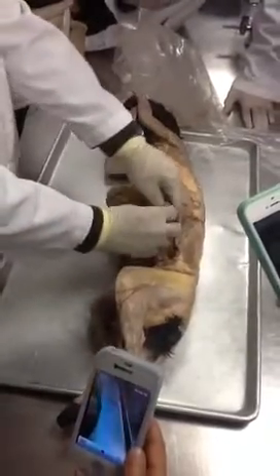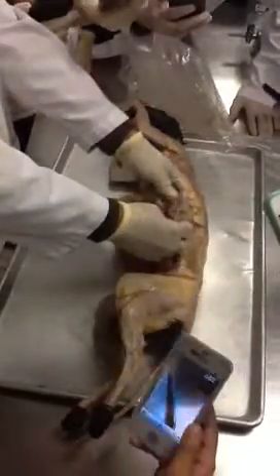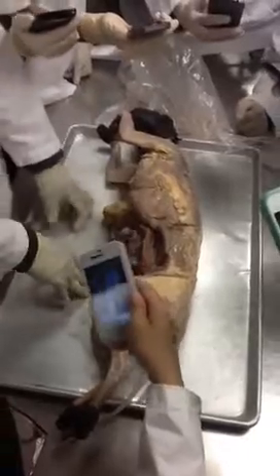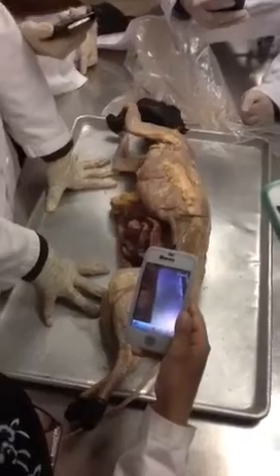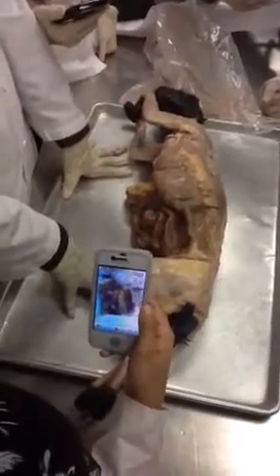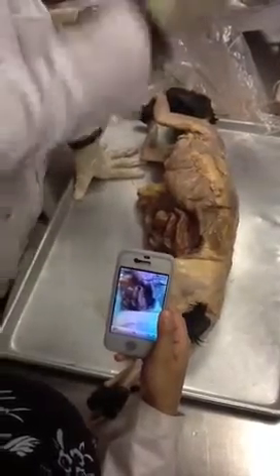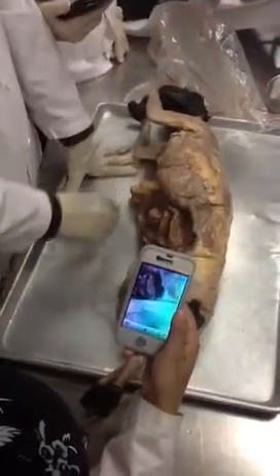Now another thing. What is the name of this membrane? Can you see the membrane? Light is passing through. What is the name of this thing? It begins with M. Membrane. Yes, try. Mesentery. Yes. Don't try everything, alright. Mesentery, yes. Which one? This one. Mesentery, yeah?